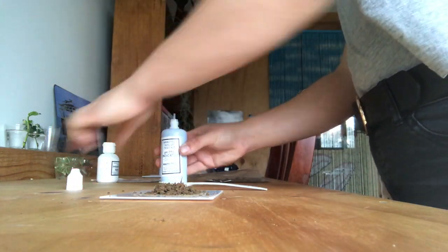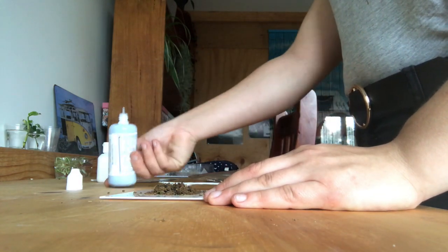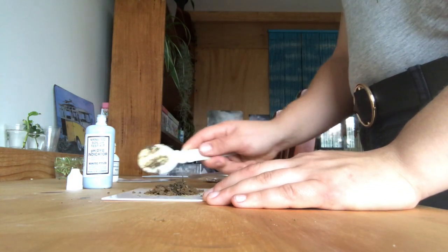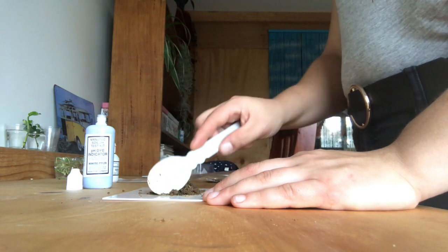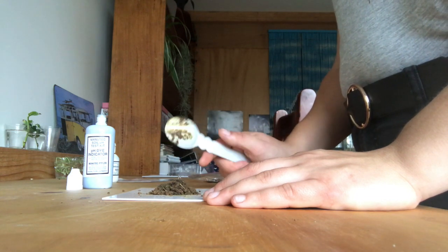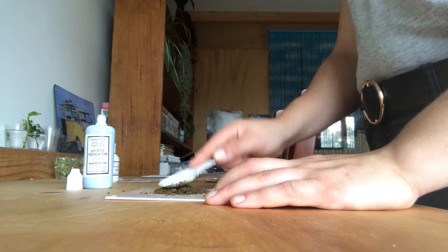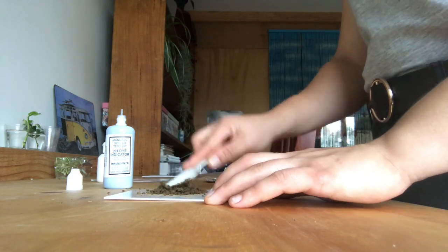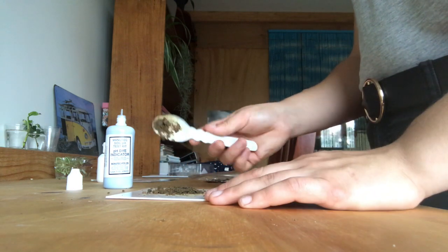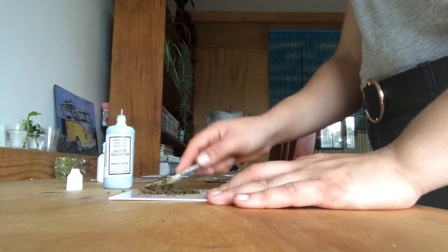Open it up and place a few droplets on the sample. The aim is to get the sample to be the consistency of toothpaste. So it's not too wet and soaking, but it's damp enough to do the test accurately. Use your mixing stick or your spoon and mix the dye into the soil sample. You can usually tell if your sample is now damp enough, as it should start sticking to your spoon, especially if it does have a large amount of clay content.